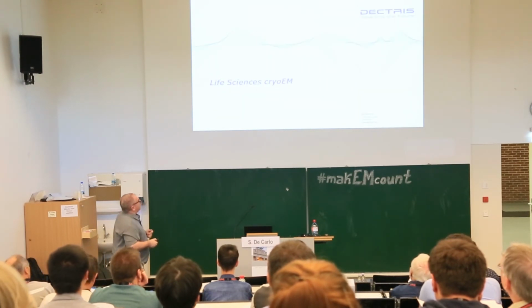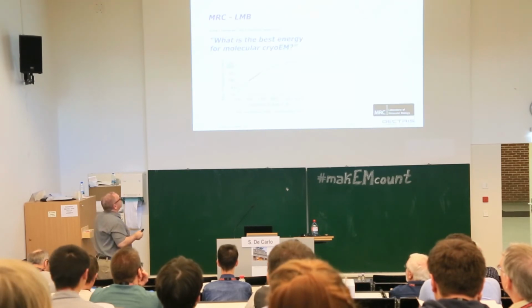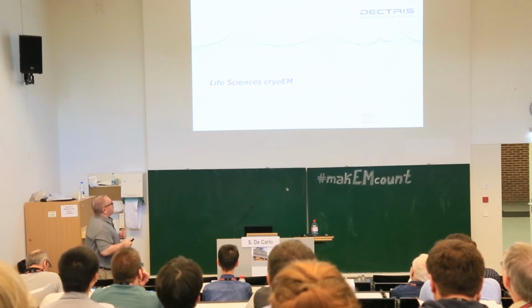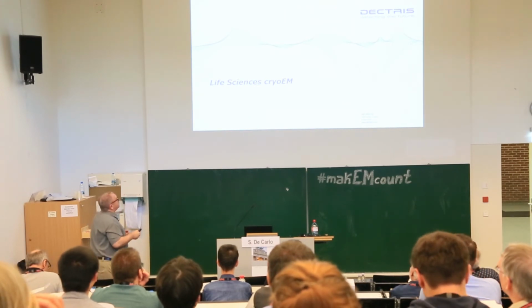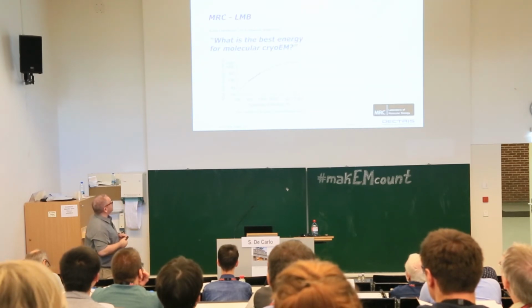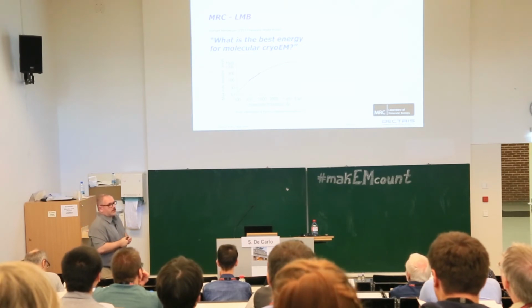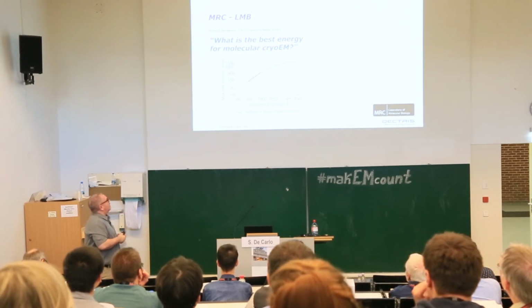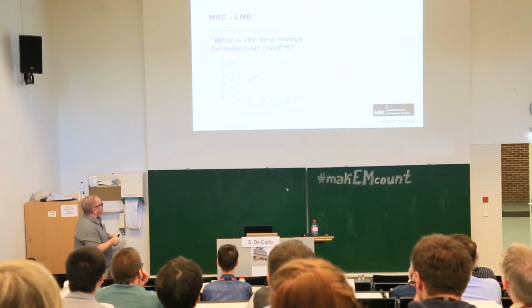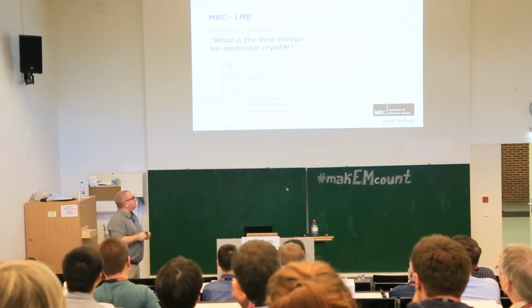All right. The last few slides I have are for life science cryo-EM. While we have been working to produce these detectors for materials science, we also collaborated since the beginning with Richard Henderson and Chris Russo at the MRC LMB. And as for the life scientists among you, you may be aware that they have been advocating maybe rethinking the theory for single particle cryo-EM.